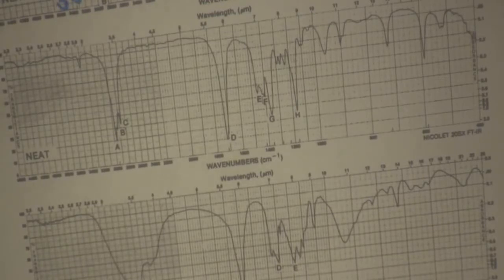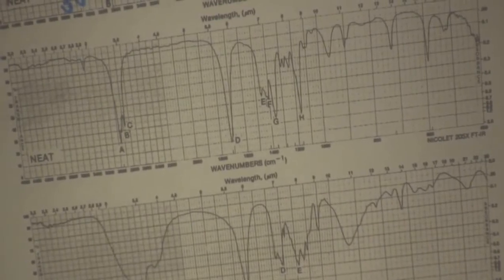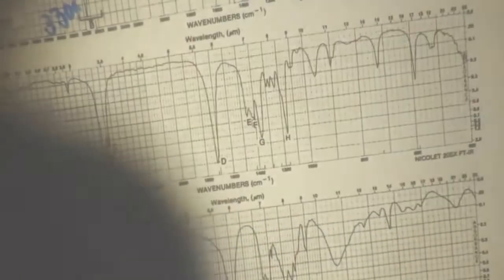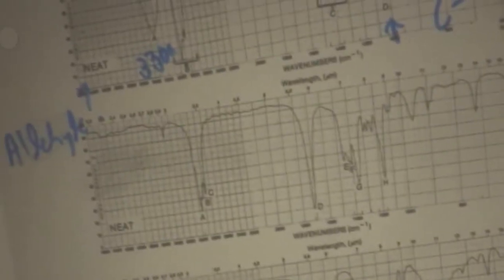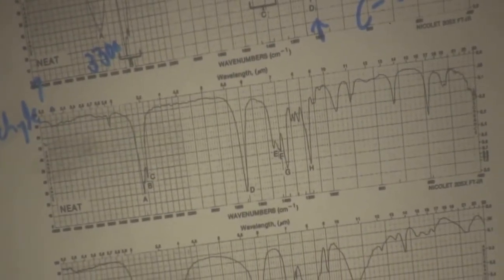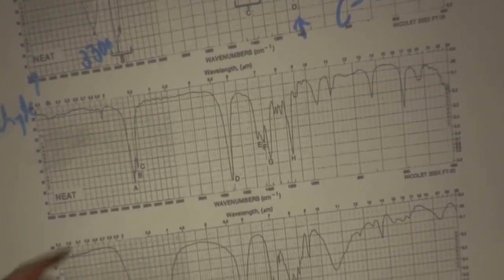So we have aldehyde. Aldehyde. Everyone agree? How would that differ from a ketone spectrum?